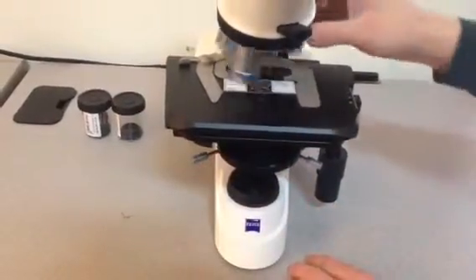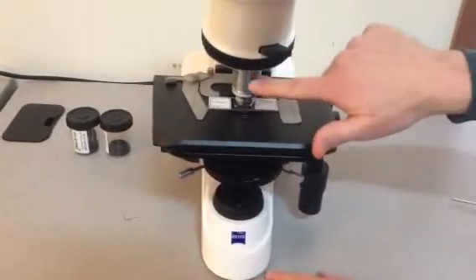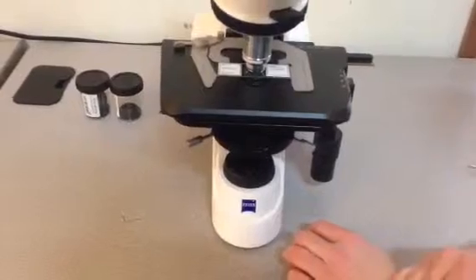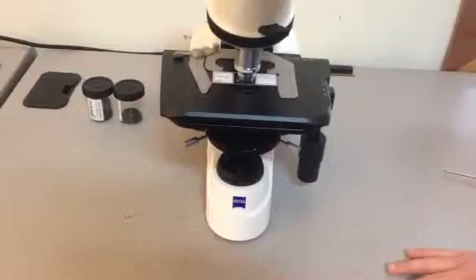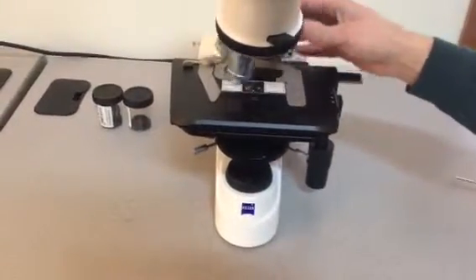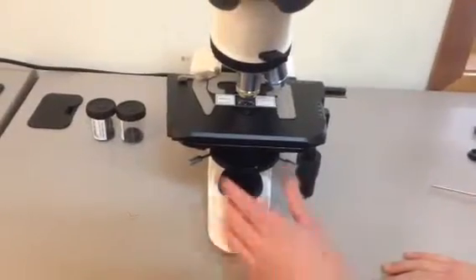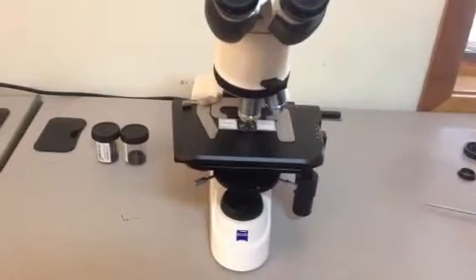When you're using 100x, you go to phase three. If you use that combination of objective and phase ring, you'll be working in phase contrast. The final setting on the condenser is DF, which is for darkfield — an oblique microscopy technique that also helps to contrast unstained specimens. To use it, all you do is engage DF. Note that darkfield only works at the dry objectives, 10x and 40x; it does not work at 100x. So those are your settings: brightfield, three phase settings, and darkfield.